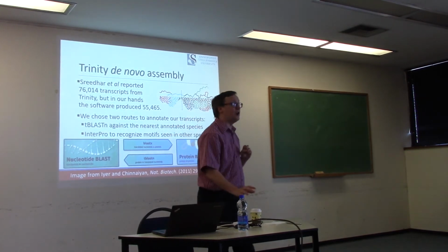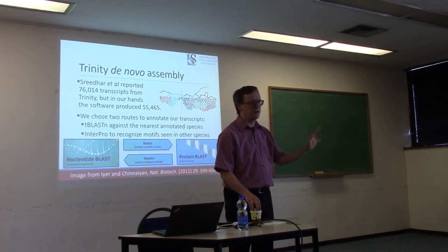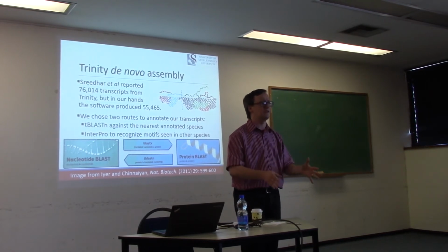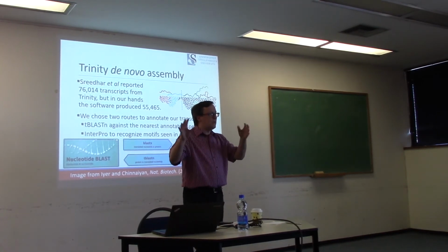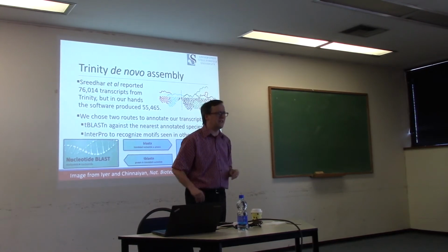We used some software called Trinity. Trinity is a really widely used toolkit. It is certainly not the only one. There are always people developing new algorithms for particular applications in genomics. So we were able to use Trinity in a kind of advanced form. I think it was version 2.1 or 2.2, something like that.